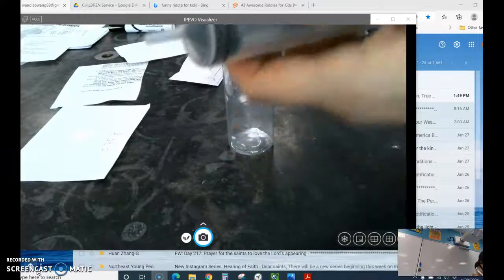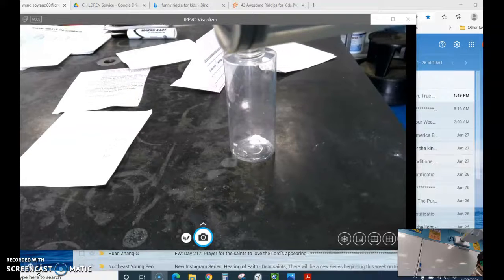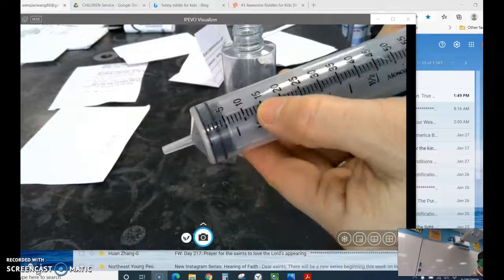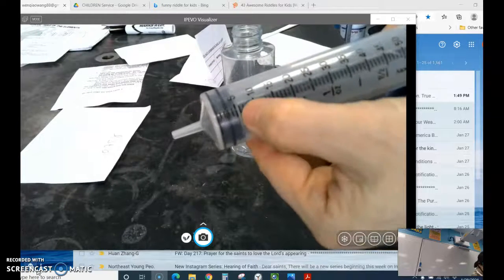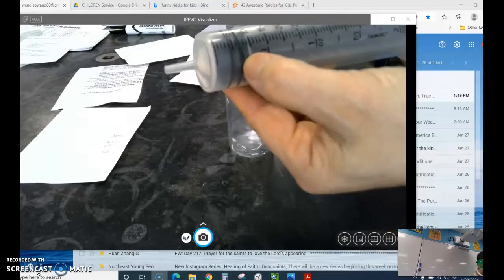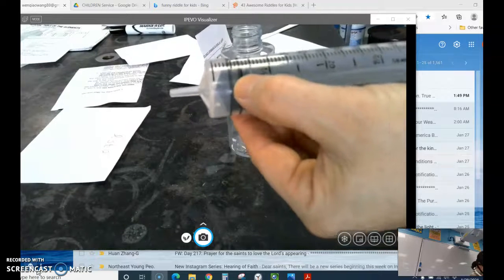So what it's going to do is, guys, you pay attention to see this part. I want to see well. This one. So they have 5, 10, 15, 20. So the unit is milliliter, ml. So you see the 2 black lines. Can you see 2 lines?